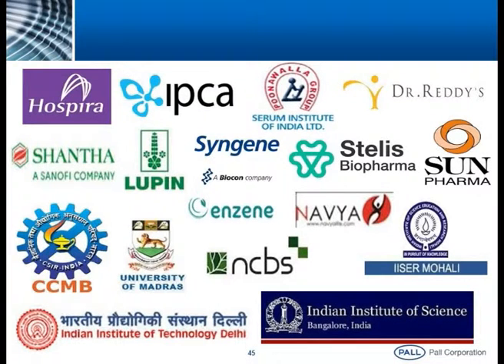So in India, we have installations everywhere, in industry as well as academia. We have an instrument at the Indian Institute of Technology Delhi and at the Indian Institute of Science, IISc. We have the small Blitz instrument at IISER Mohali. At Madras University we have a very small single channel instrument. At CDRI we have a small single channel. At CCMB in Hyderabad we have the same instrument. The rest are other industries where people are using it.